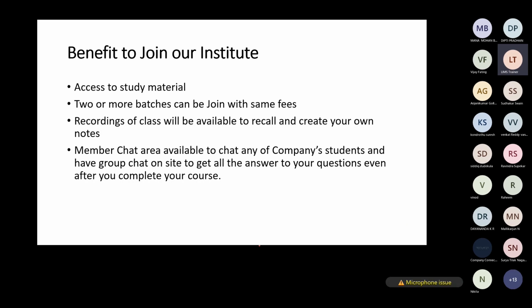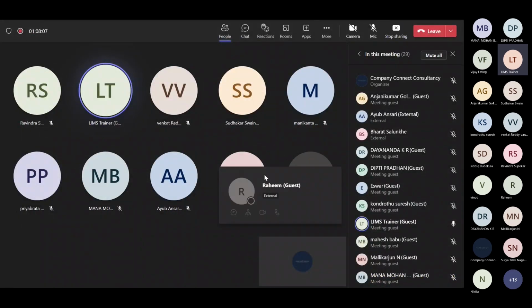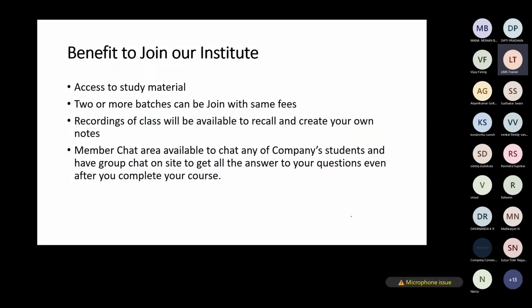I'm talking about the IT side here. If you directly work with a pharma company for this tool, you may be working as an analyst, right? Entering the data, entering the values, or you might be working with LabWare. Or you might be working with the IT companies, giving them the requirements that we are not able to do this, or please help us do this. So different kinds of roles, right? Now, if you are working at LabWare itself, then you will be directly developing.